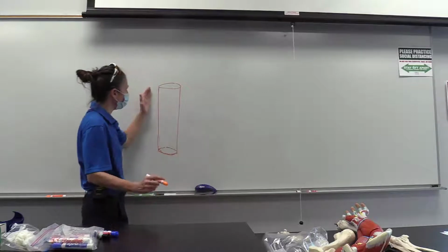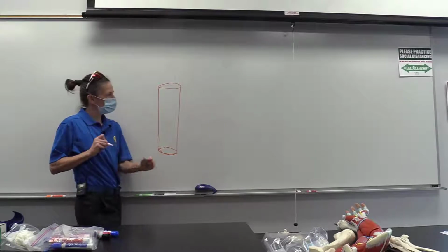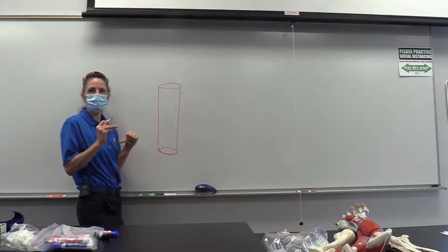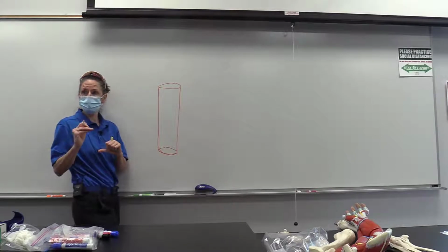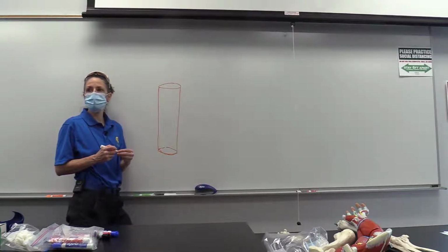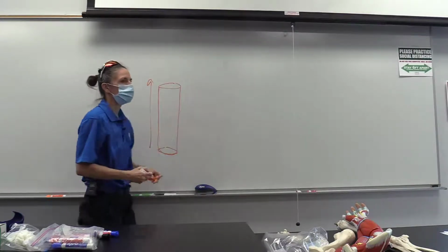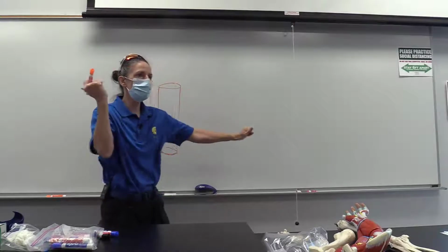So if we put this thing in distilled water, we had 3 of them so that we could have 3 repeats. Well, first of all, what did we do to measure the change, to see if there was a change? We measured them before and after, right? So they're all cut to 6 centimeters, and then we saw if they grew longer or shrank, right? So what happened after this thing was put in the distilled water? It grew, it got longer, right? Because it took on more water. And then you put the one in the 5 grams of salt solution, and what happened to it? It shrank because water went out.